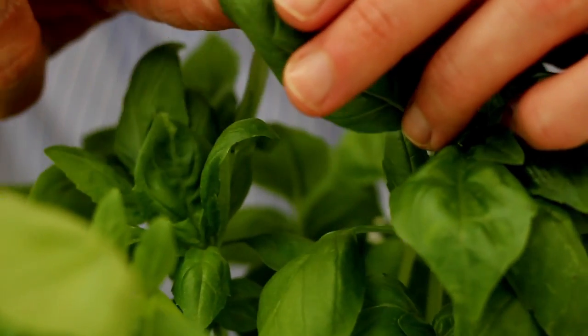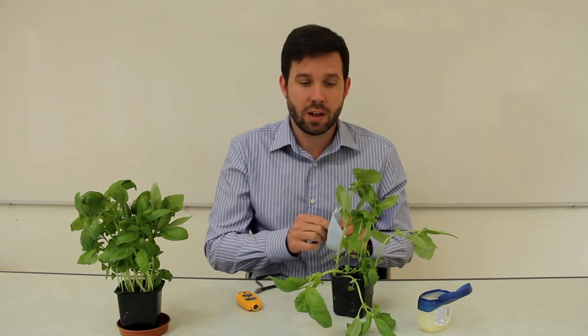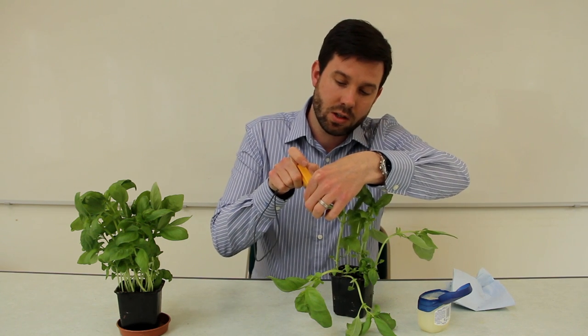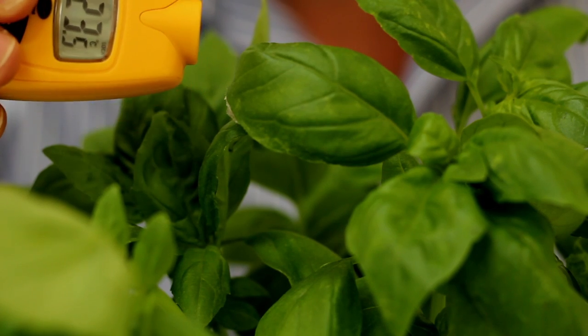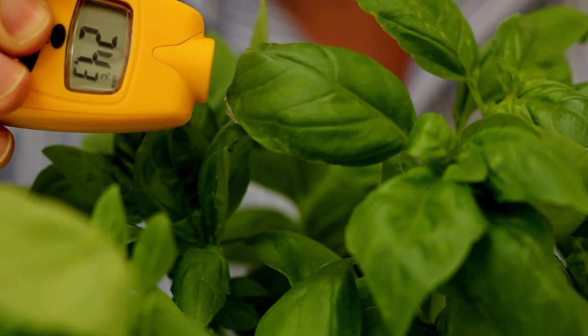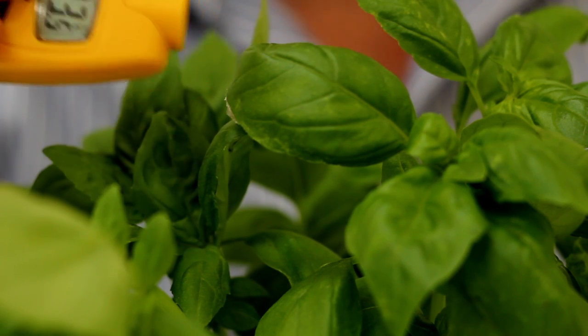You could also do this in your school grounds with a plant. The investigation is all about measuring the change in temperature of that leaf. What you'll find, if you take the temperature of the same leaf that you've applied the Vaseline to over a course of about 10 minutes, is that the temperature of the leaf will increase due to the reduction in evaporative cooling on that leaf.